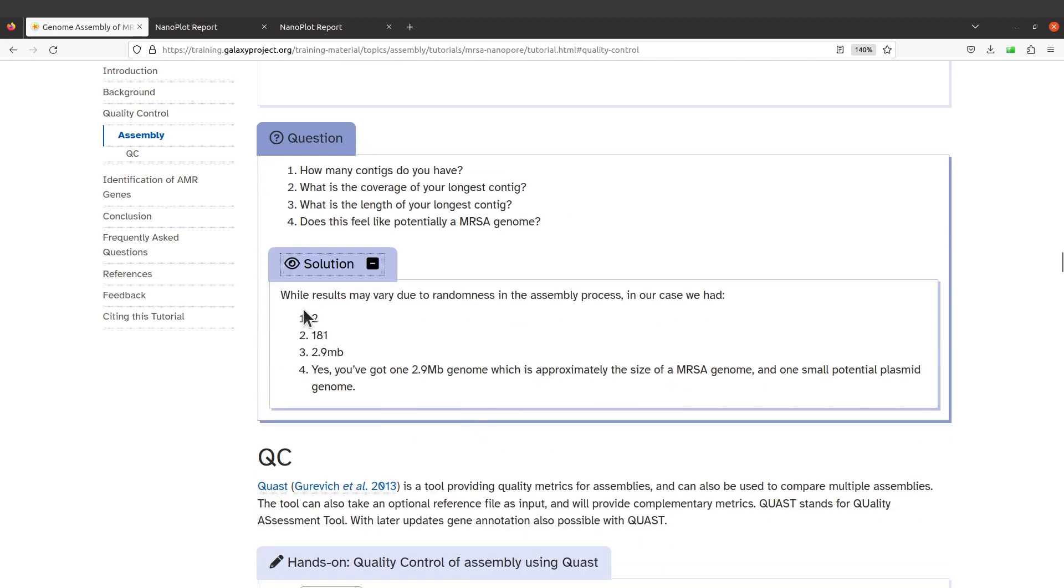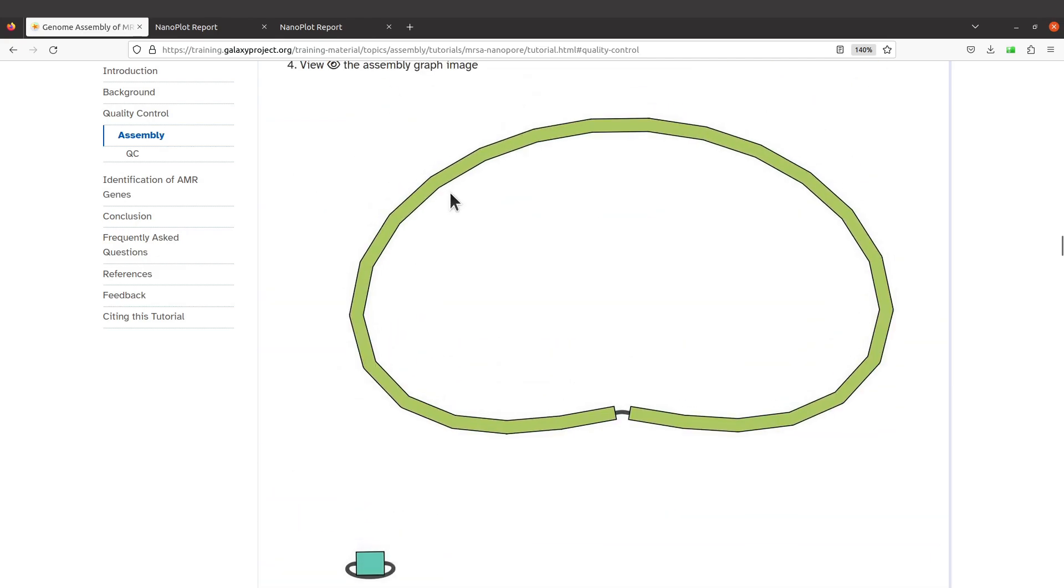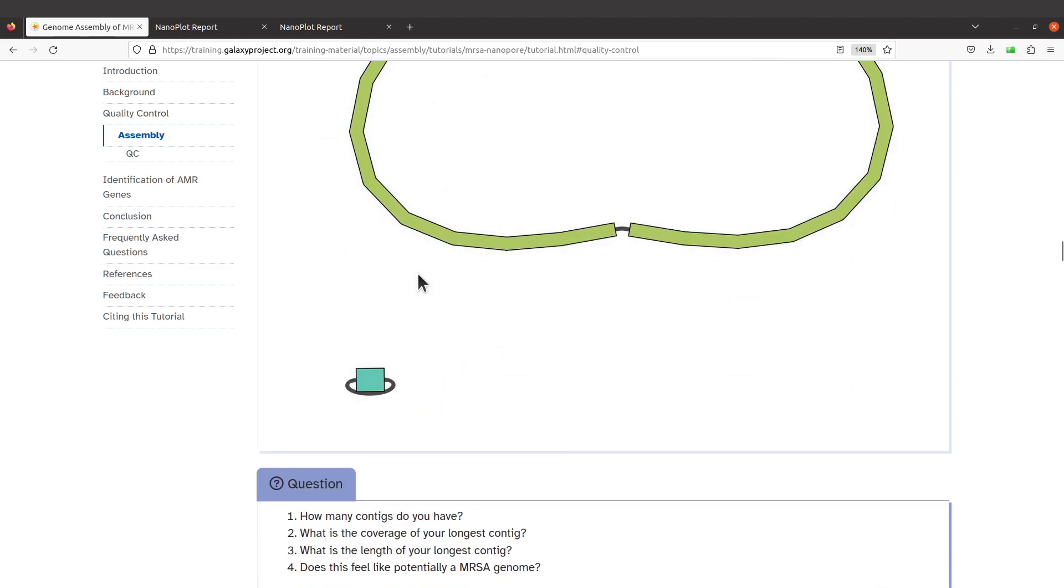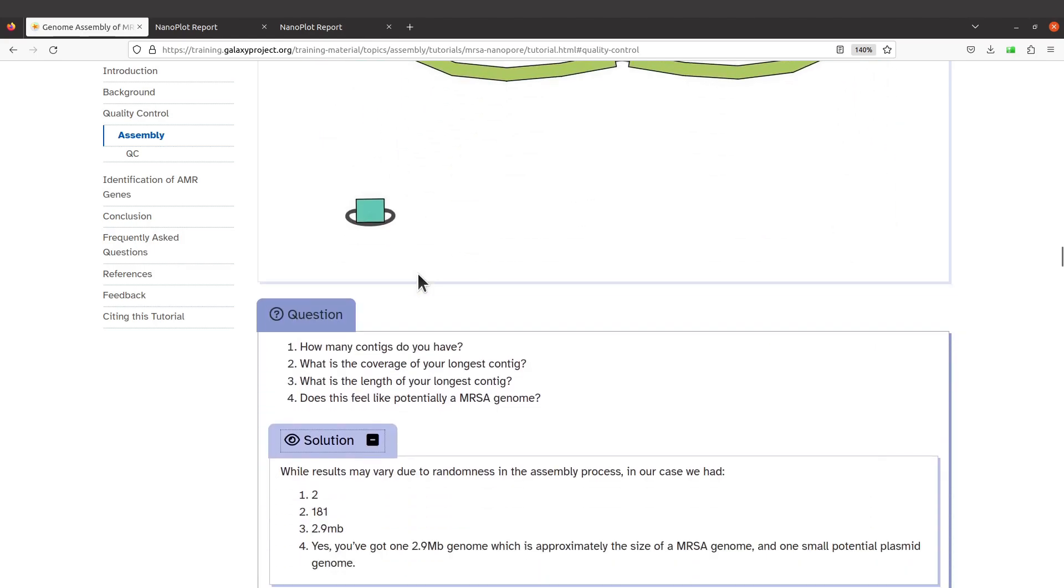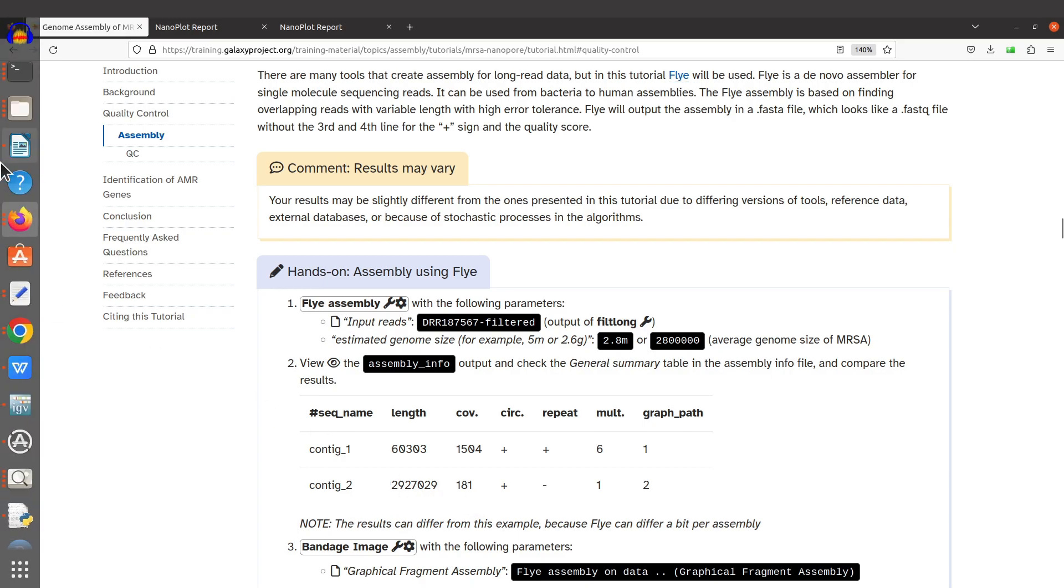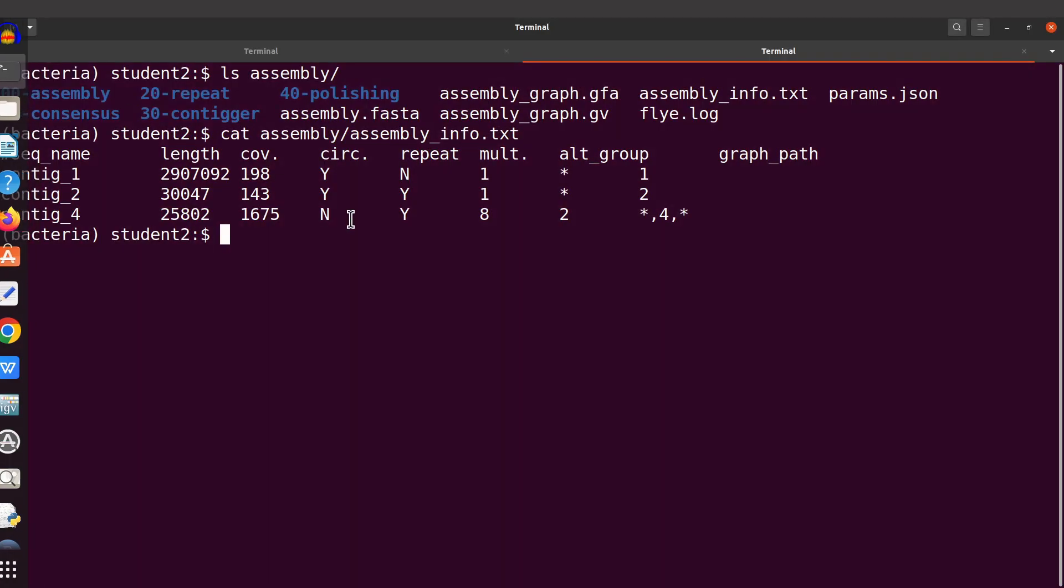Let's look at the solution. It says two, that's the number of contigs that was displayed here, but on my PC I had three. What is the coverage of the longest contig? 181. That is here. But for me, the coverage was 198. That's what I have here.